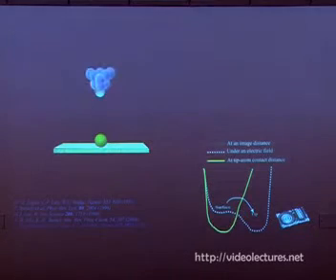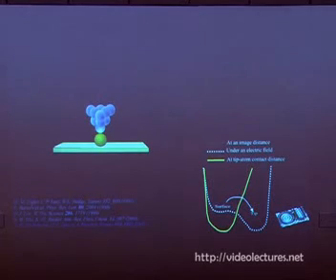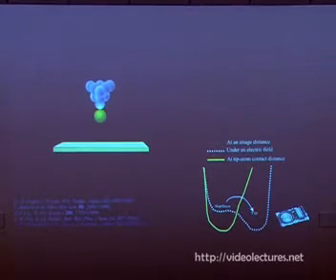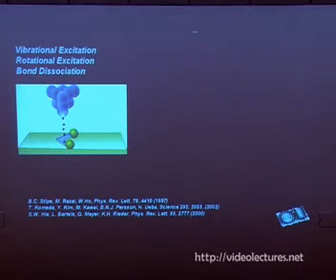Building using single molecules. The second technique is known as vertical manipulation, where we can transfer atoms and molecules between the tip and the sample. The third technique is an important technique known as inelastic tunneling. In this case, we inject the tunneling electrons to vibrate the molecules, or to rotate the molecules, or to break the molecules. We can actually take out individual atoms from the molecules with single bond precision using this technique.